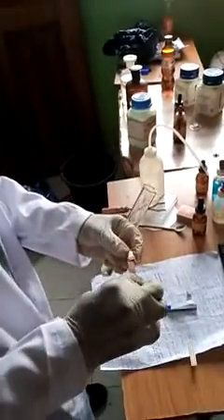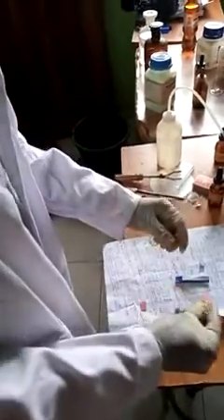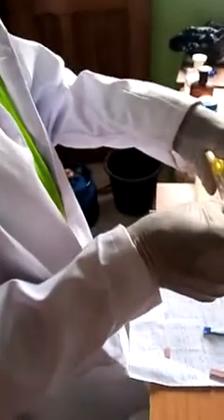Let me start with red. We don't know the salt. We don't know what it's going to give us. So you use the two to test. So let me start with the red. I will dip the red into it and see what is going to happen. There is no effect. It has no effect on red litmus. So let's also look at blue.